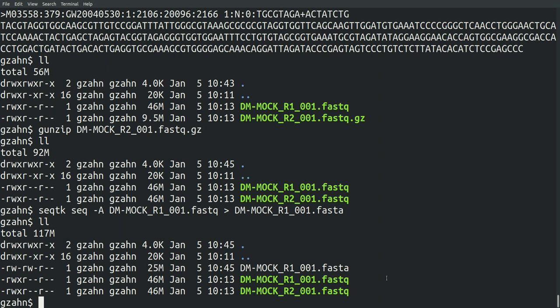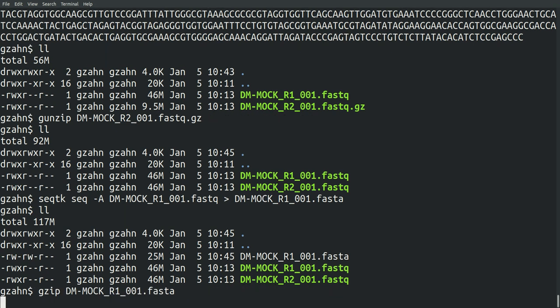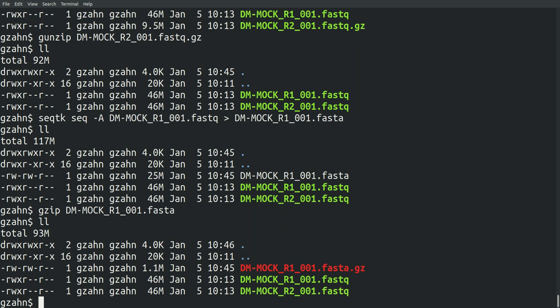Now if I want to compress that, I can say gzip, give it that file. And now look at that. It's down to 1.1 megabytes instead of 25 with a FASTQ. So that's compressed.